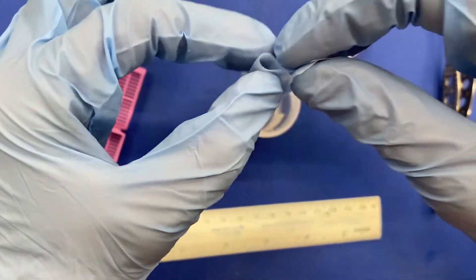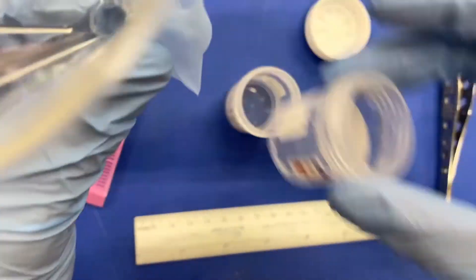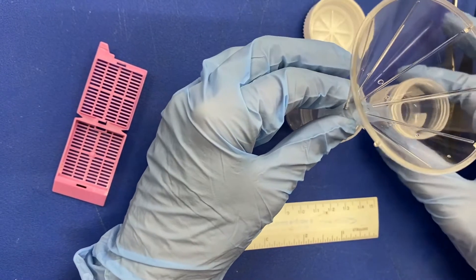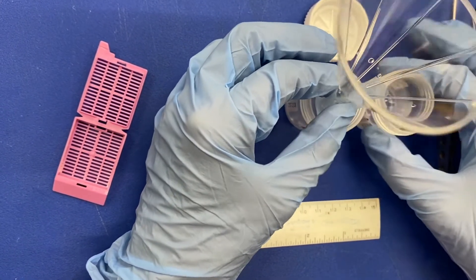Now, take the biopsy bag again with your funnel and place it over the original specimen container. This ensures that if there are any small fragments of tissue that you may have missed the first time, that you get them.